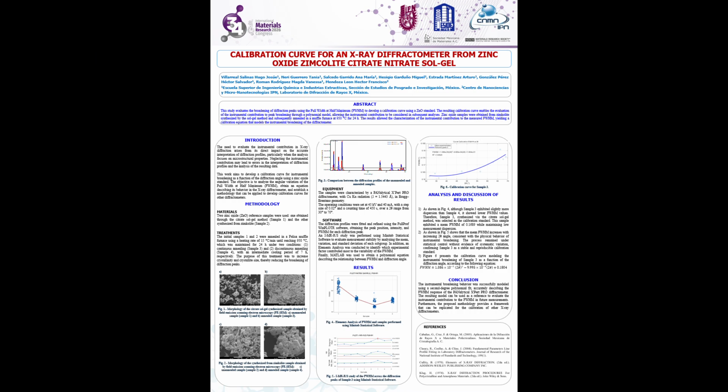Good night, my name is Hugo Villarreal and my work focuses on the development of a calibration curve for an X-ray diffractometer using zinc oxide samples as reference materials.